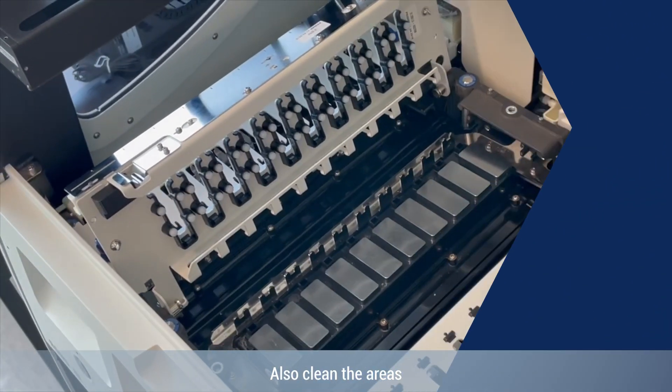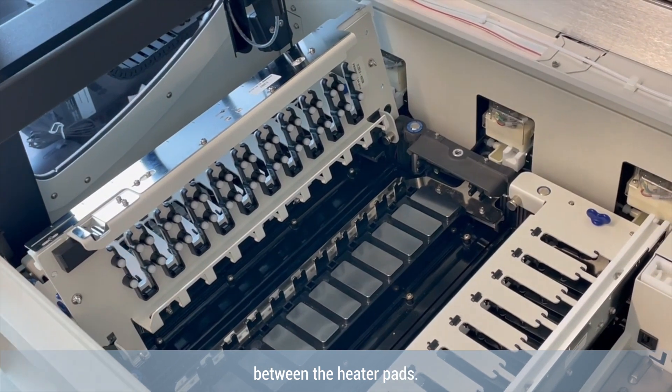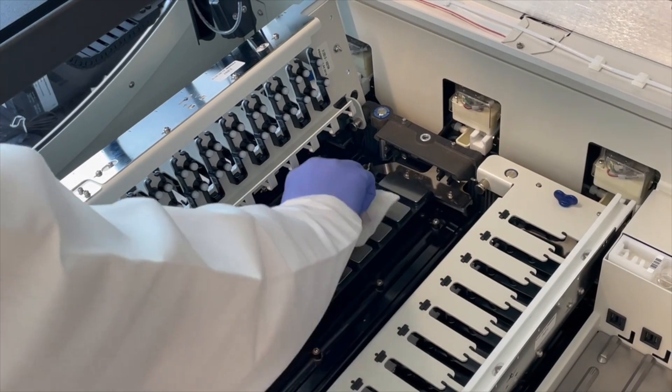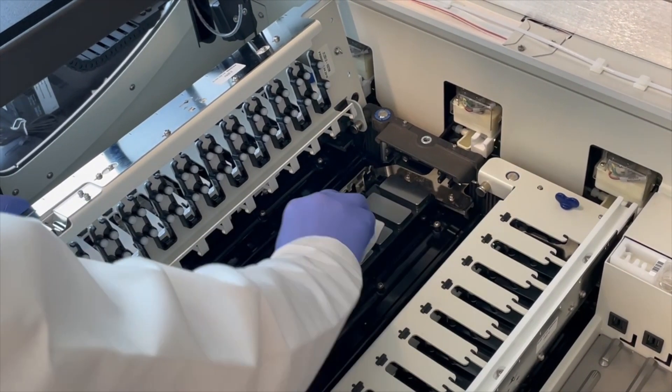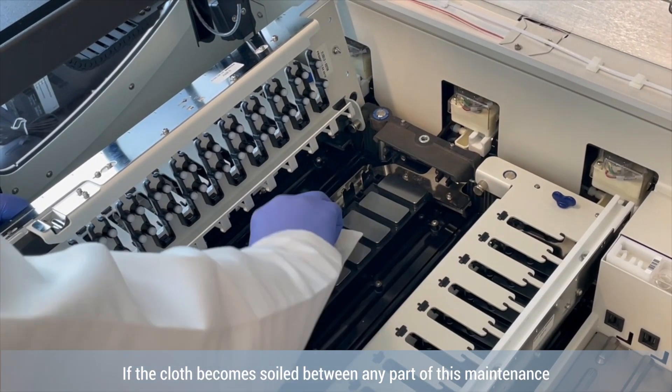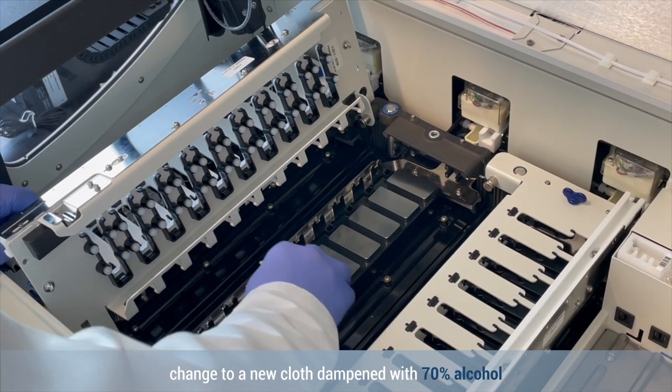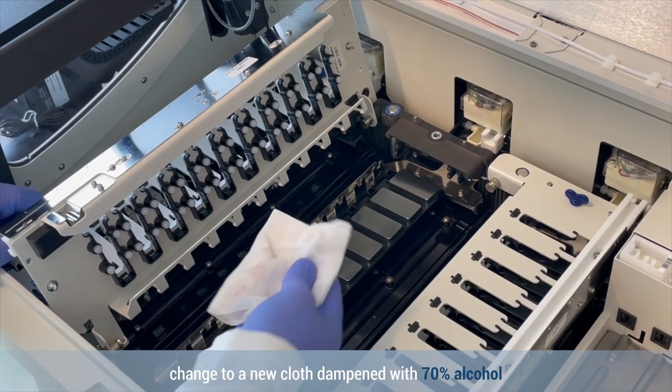Also clean the areas between the heater pads. If the cloth becomes soiled during any part of this maintenance, change to a new cloth dampened with 70% alcohol.